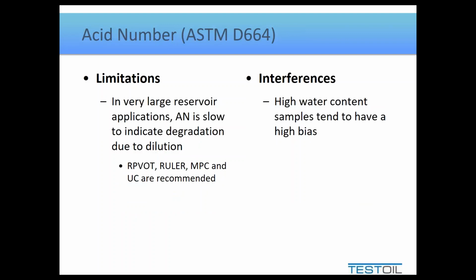Now, in terms of limitations, it has the same limitation. It may not have the resolution to witness significant changes in oxidation or degradation, as compared to some other tests, and it also has the same interference with water content. What it does not have is any issue with the darkness of the sample. That it can work around quite readily.